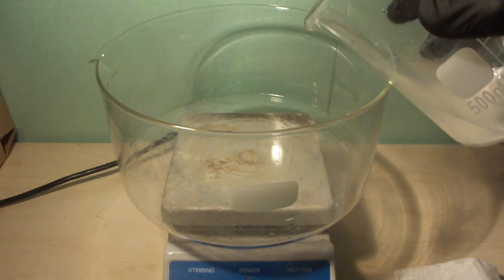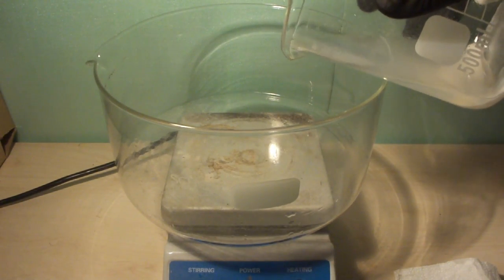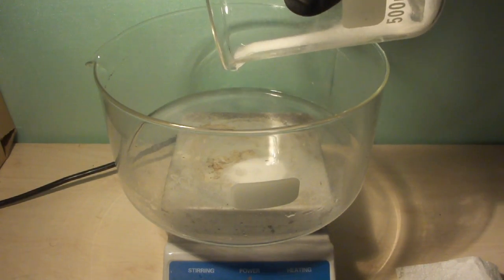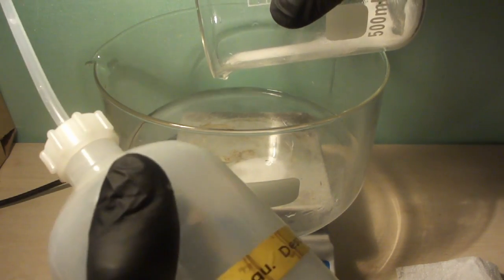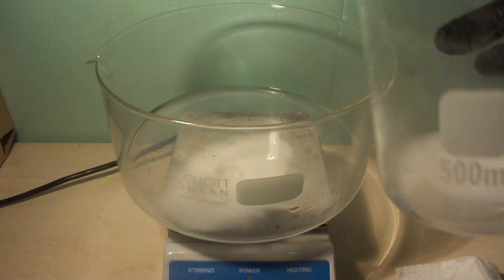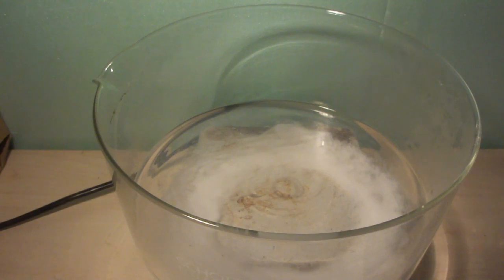To speed things up, we transfer our barium nitrate solution into a large evaporating dish and crank the heat up. Barium nitrate will only start to decompose at around 550 degrees centigrade, so we don't have to be particularly careful with heat control.